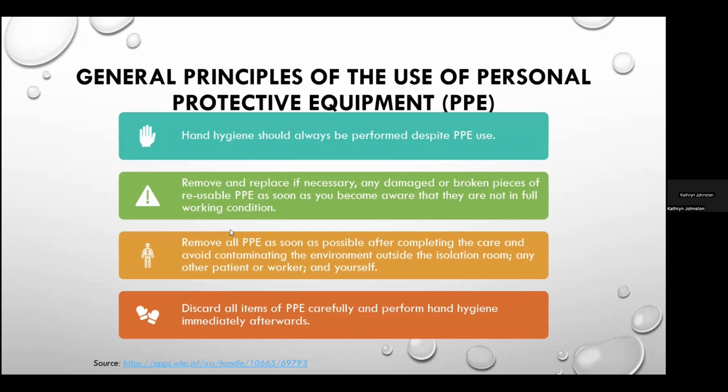When you leave that area, then you need to make sure that you remove it after completing the process or when you leave that area. And that protects not just you, but also your coworkers. And then after removal of PPEs, hand hygiene should always be performed. And as I stated earlier, gloves do not replace the need for hand hygiene.